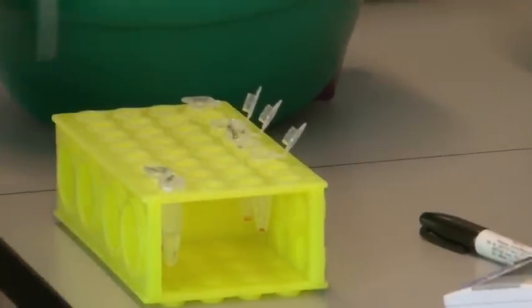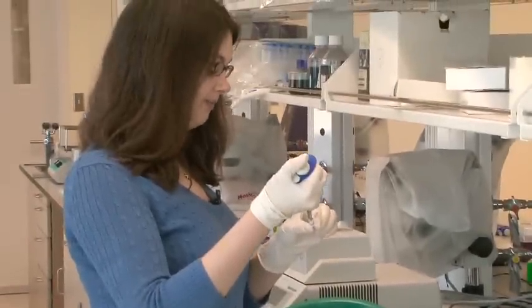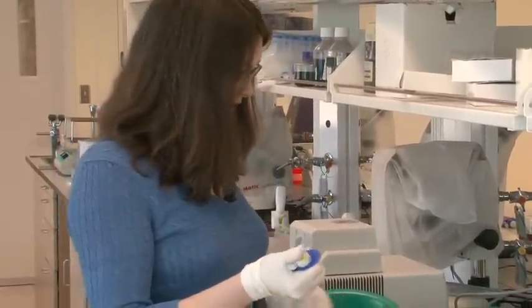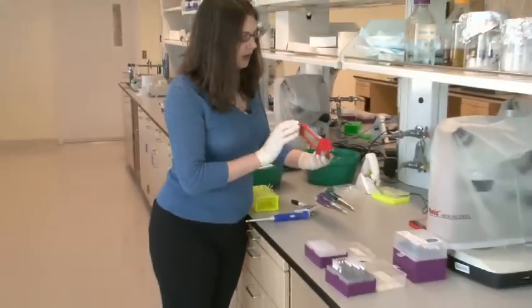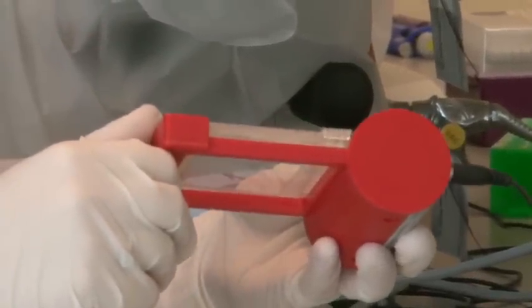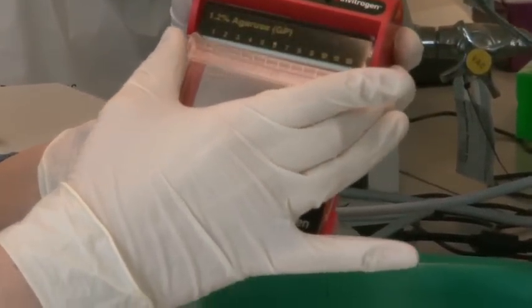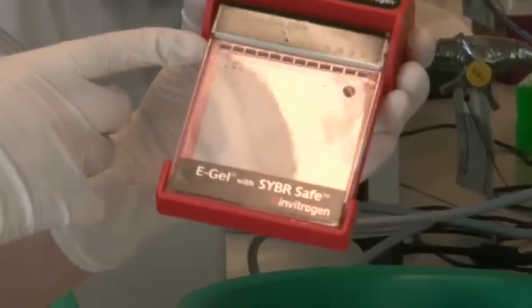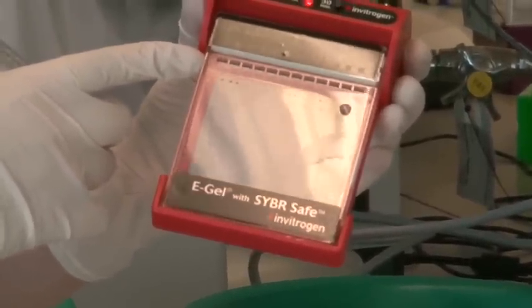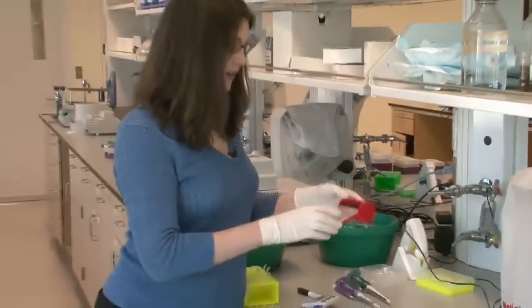Okay, so now that we have all of our DNA samples to load onto the gel, I'm going to load them onto the gel. The way that works is that this is your slab of gel right here. If you can see from the side, the gel is actually coated in 2 pieces of plastic, but the opaque substance in the middle is the gel matrix. Now this gel right now has a plastic comb in it that's protecting 12 holes in the gel. We can load each DNA sample into one of these holes. So I'm going to put the gel down onto the lab bench.